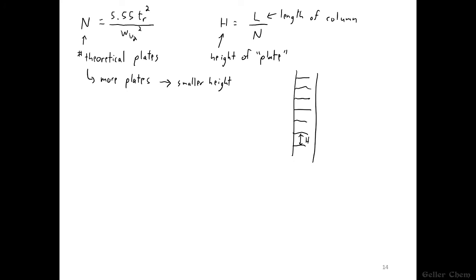This in turn will lead to a more narrow peak as the solute exits a column, which as we saw in the previous animation, means that we'll have a better separation of solutes.